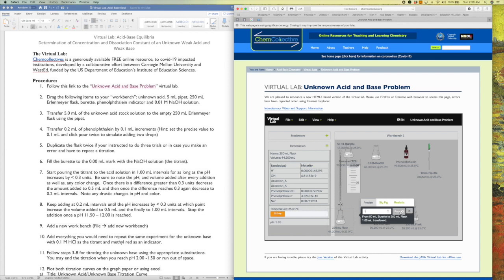All right, so that was 0.07, right? That was 0.08, so it's definitely the increments by which the pH is increasing are getting larger. And that was 0.09, right? So we really need to start getting careful now. That was 0.11. So now the increment has increased by a little over 0.1. So we want to be very, very careful. I'm going to go by 1 ml again now.